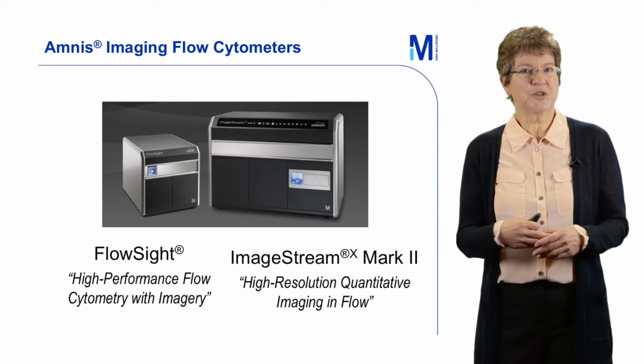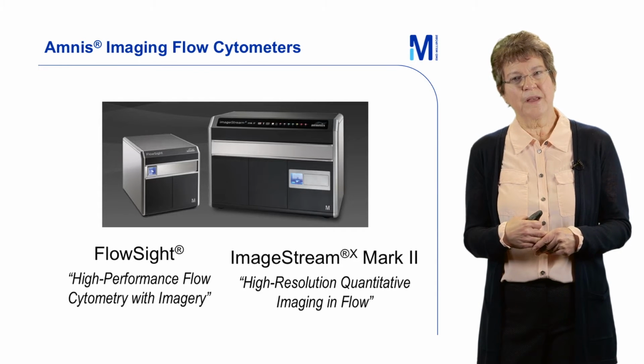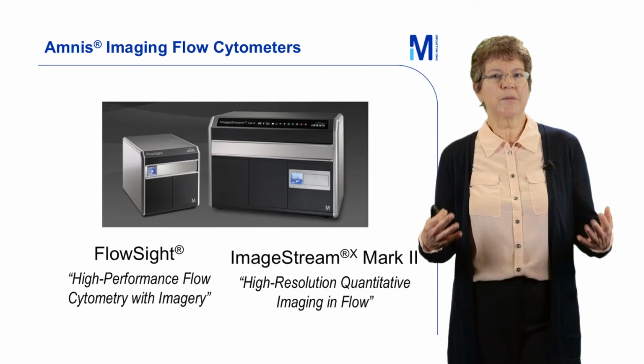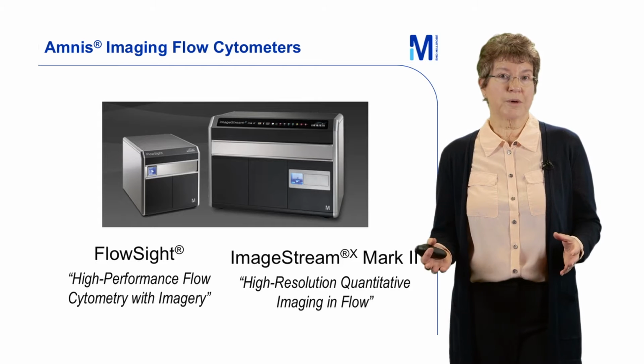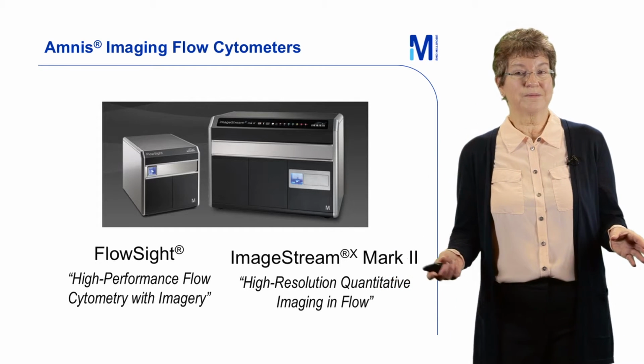Here's a picture of the instruments, the FlowSight on the left and the ImageStream X Mark II on the right. They both operate under the same principles, the same engineering principles. The main differences are the footprint, the cost, and the resolution.